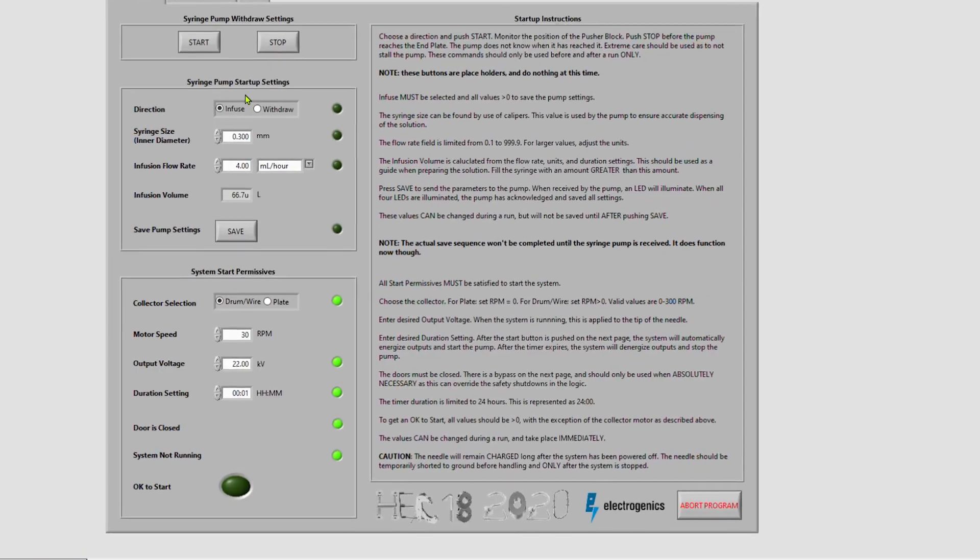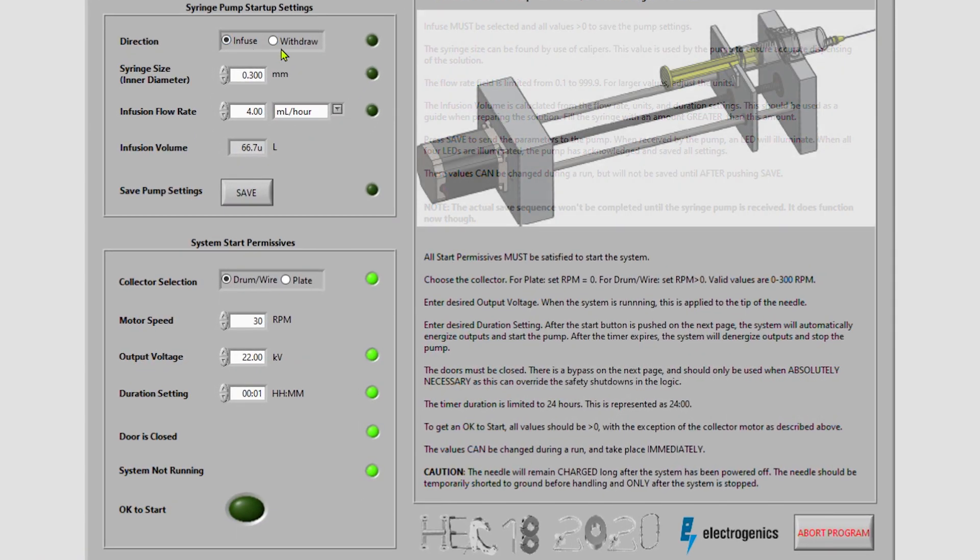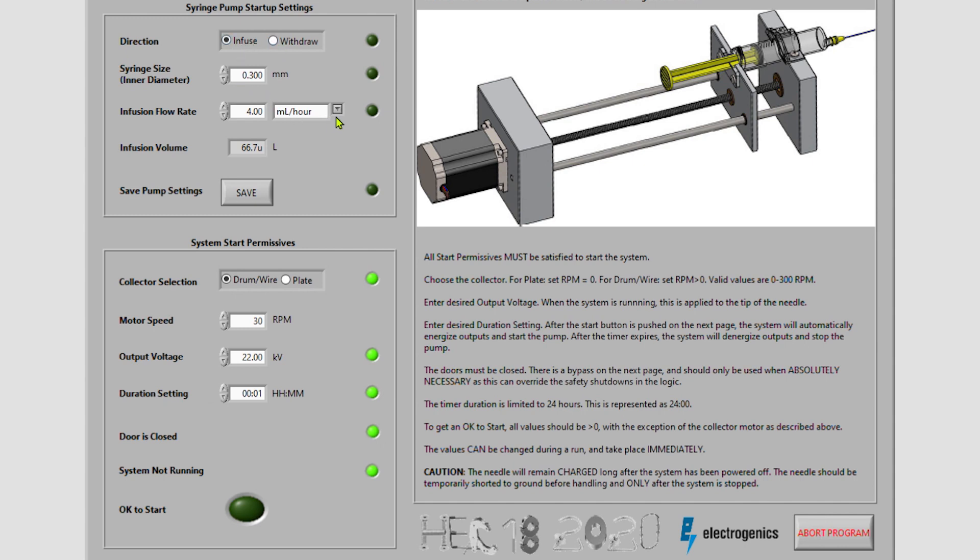The LabVIEW interface was designed to be simple and easy to use. Simply choose your parameters, units, and push save.